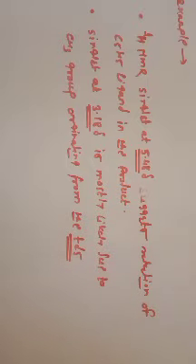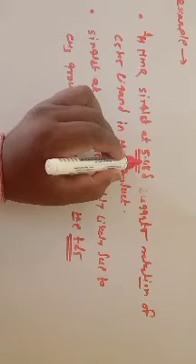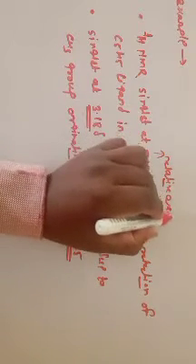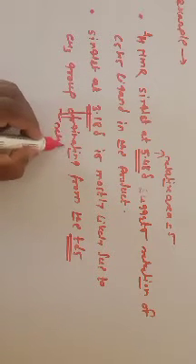And the relative area is also given: for 5.48 delta the relative area is 5, and for 3.18 the relative area is 6.